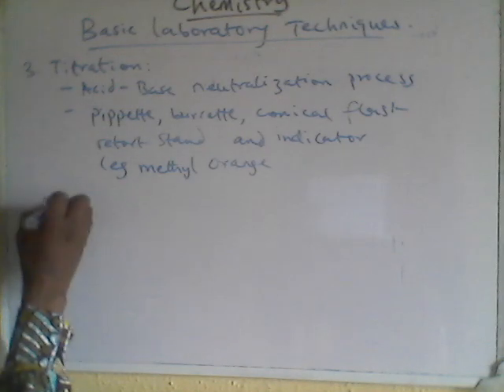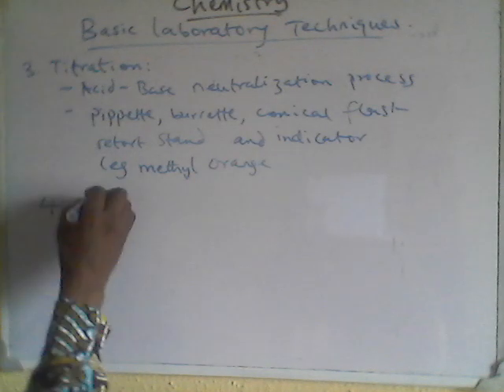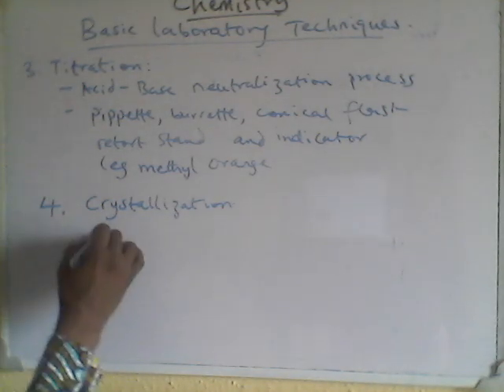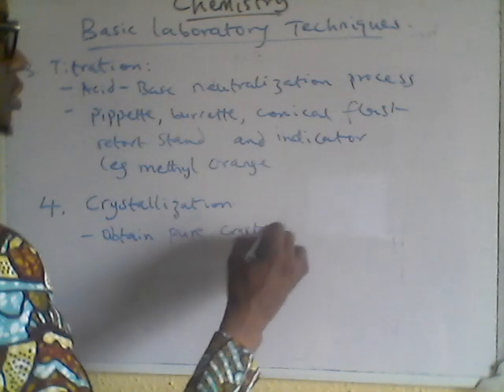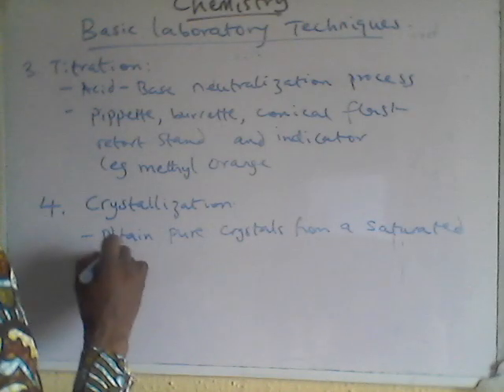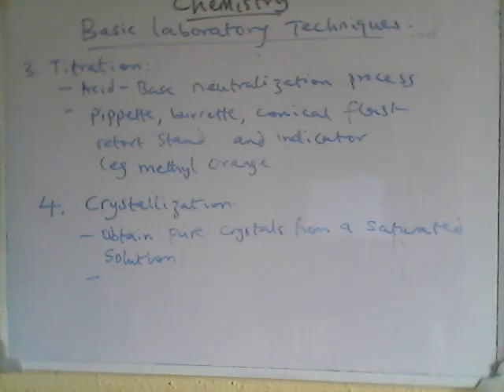Another procedure in the laboratory is crystallization. What is crystallization? It's where you obtain pure crystals from a saturated solution. Please check out our video on solubility. You will see these terms and descriptions being used. So there is a process in the laboratory called crystallization where we obtain crystals from a saturated solution.